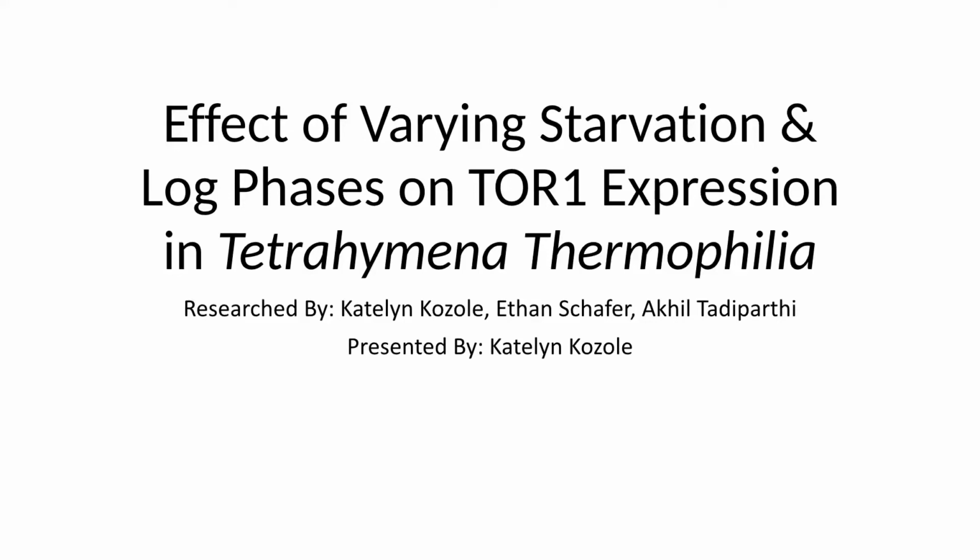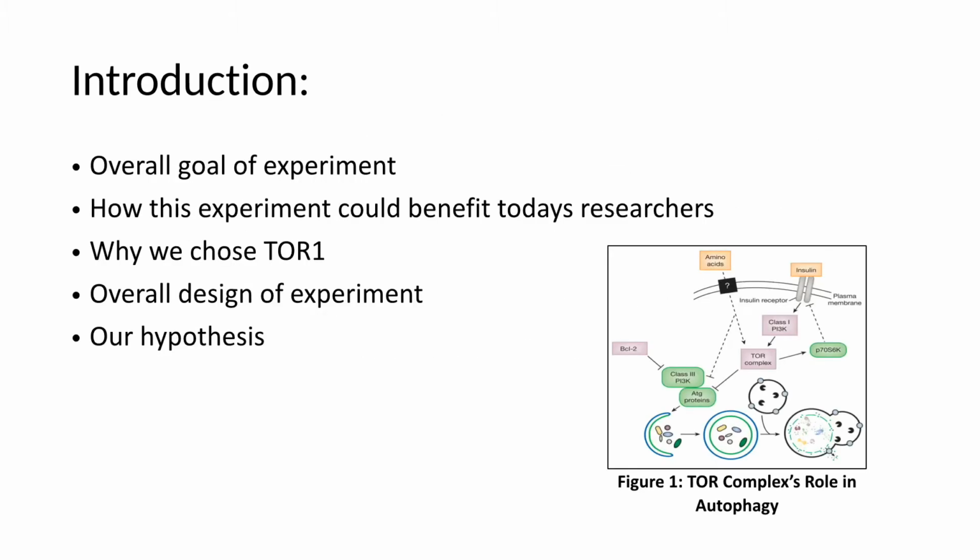My group studied the effect of varying starvation and log phases on TOR1 expression in Tetrahymena thermophila. The overall goal of this experiment was to potentially design an assay system that will allow us to screen for new autophagy drugs. In order to design a potential assay system, we needed to find a gene whose expression is altered during autophagy in Tetrahymena thermophila. In this experiment, we tested our chosen gene, TOR1, for changes in expression during starvation phases and log phases.